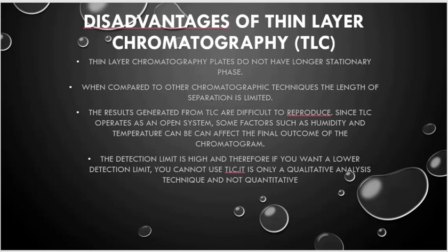The last one is that the detection limit is high, and therefore if you want a lower detection limit, you cannot use TLC. It is only a qualitative analysis technique, not a quantitative analysis technique. It can give a quantitative result, but not a very accurate or specific one.